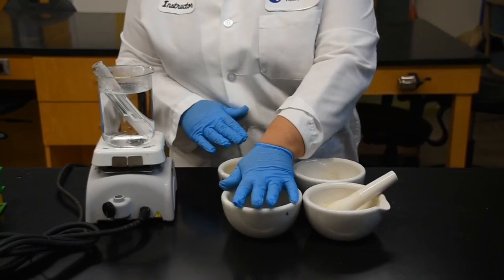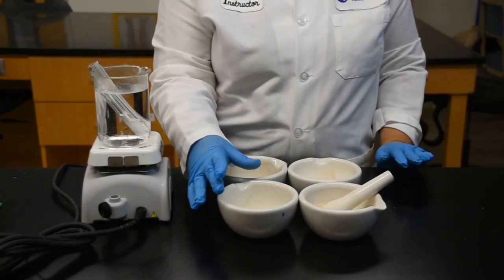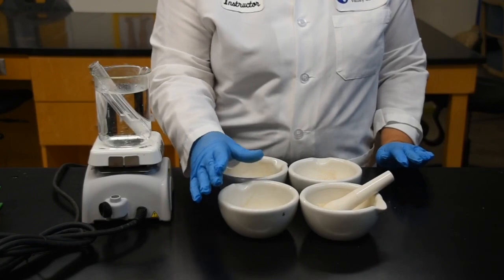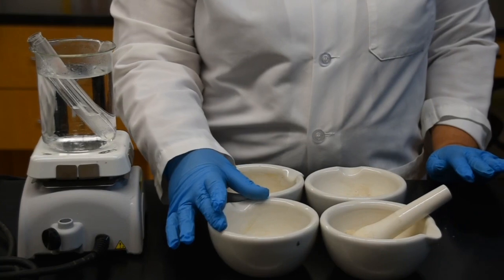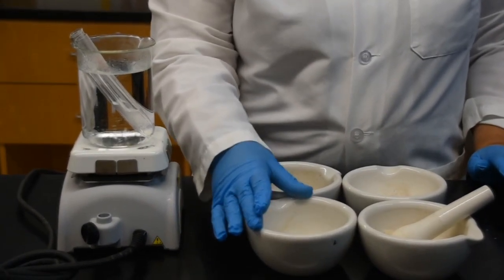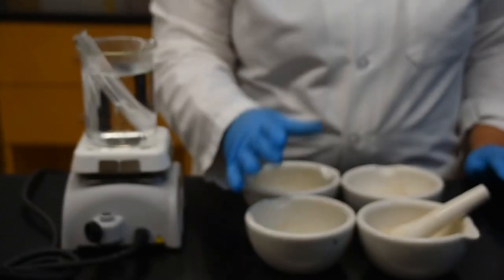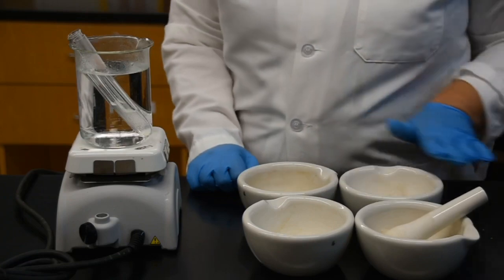For instance, let's take eggs. For eggs, I'm going to have a tube that is testing for protein. For egg, I have a test tube that is testing for the presence of simple sugar, and I will also have another tube for my egg that is going to be testing for the starch. And I'm going to repeat this for the other samples here.